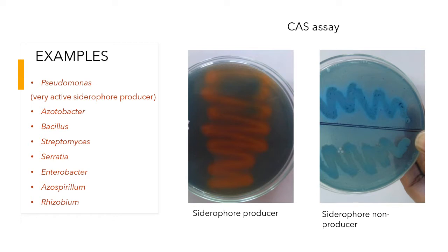Two plates are shown here. The first is a siderophore producer. The color of CAS medium is bluish; when you streak your isolate, you may see a color change from blue to orange. In the case of non-producers, there is no color change — you will only see bacterial growth.